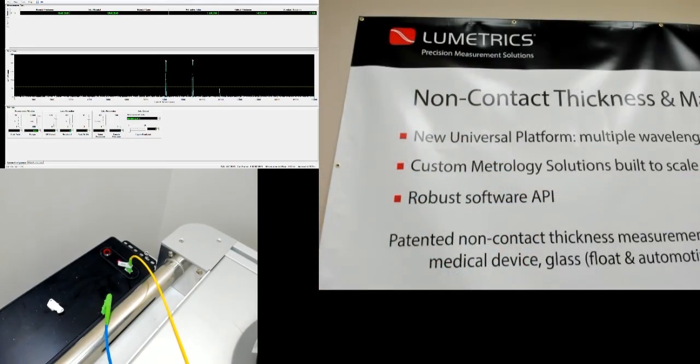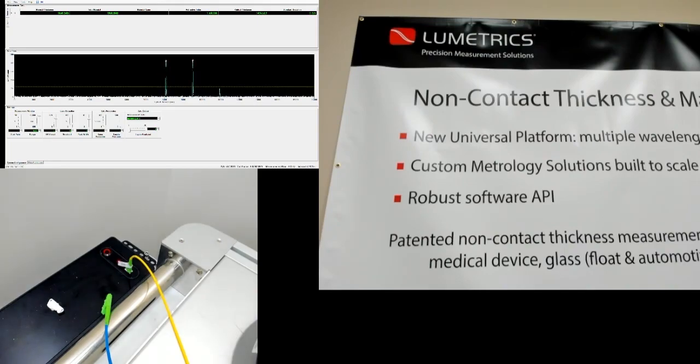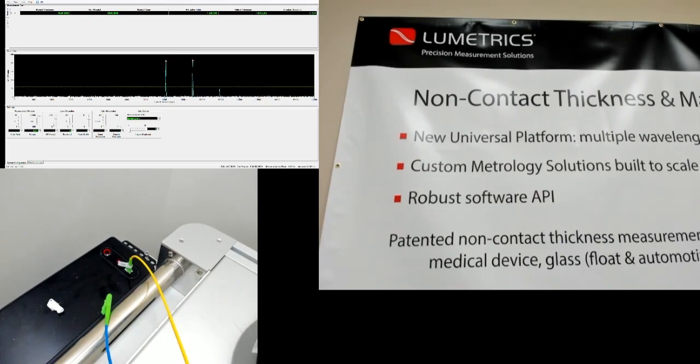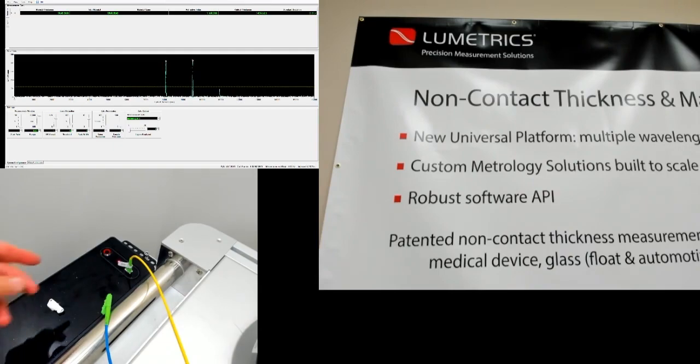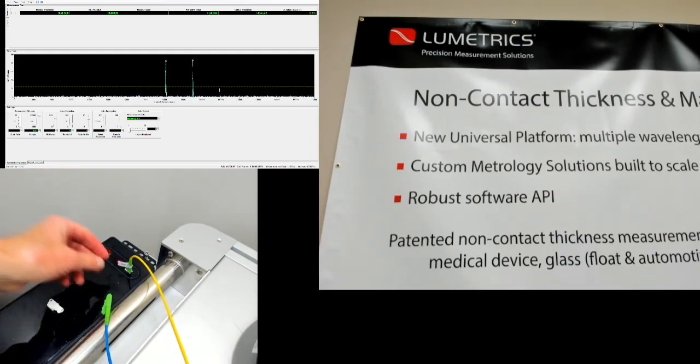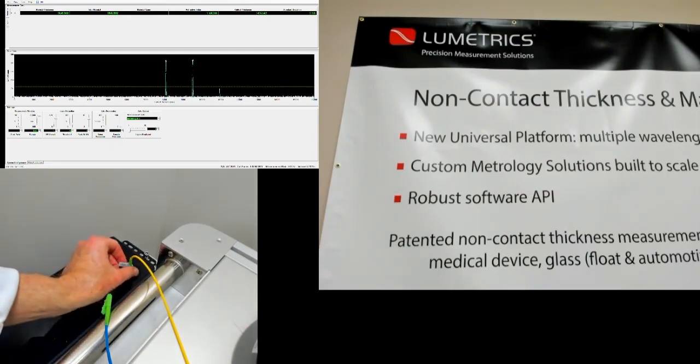Okay, so I shifted, as I said before, I shifted the view of the camera to the face of the OptiGauge. And now I can reach with the microphone, so I'm going to just very simply show you.